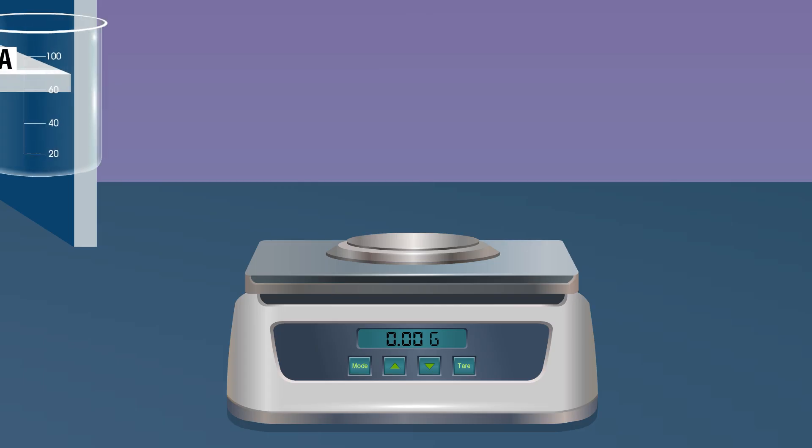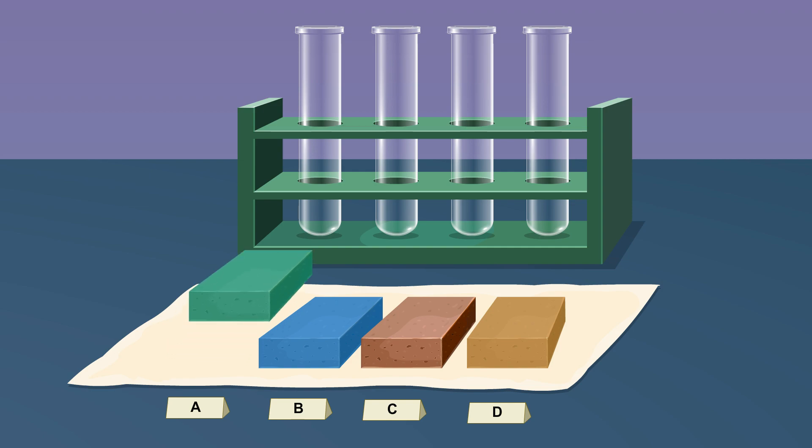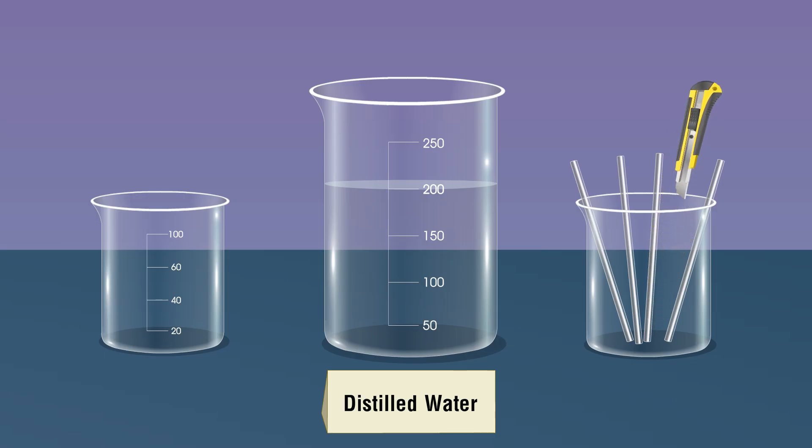Take beaker A, put the A beaker on the electronic weighing balance. The weighing balance shows the weight of the empty beaker. Use the tare button to show a reading 0.00 gram and add soap A into the beaker by making it a small piece using a cutter knife.